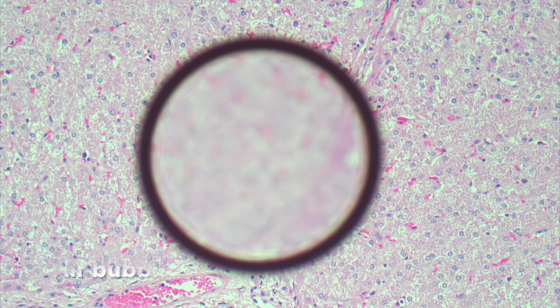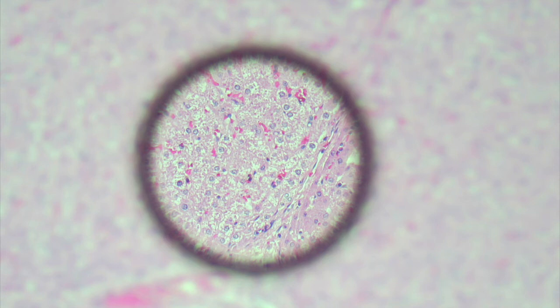Then finally, for this last example, we'll move back down to a low power field of view, and it's pretty obvious what the issue is here. You can see there's a nice spherical air bubble present within the central field of view. So that just really prevents your ability to obtain an even field of focus. You can of course just focus down through that to see what's going on within that central field, and so perhaps it's less of a problem from a diagnostic point of view.